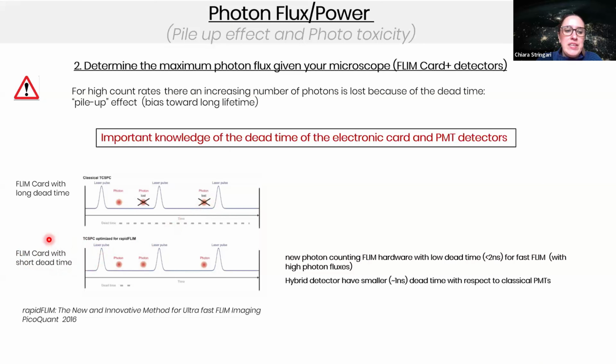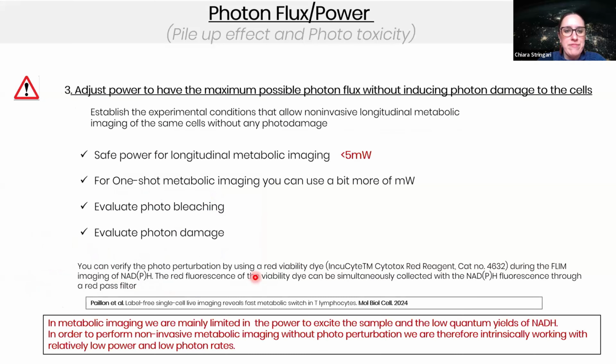Recently, FLIM cards are being developed with shorter dead time. And so with these shorter dead time cards and hybrid detectors, we can just go faster. But the bottom line is that you need to know what you have.